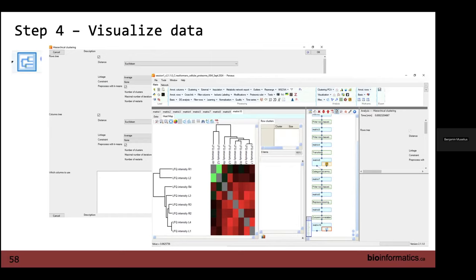So I would say it's a good default. If you know something about your data or know something about the type of information you're trying to get out of your data, you certainly can use one of the others, but Euclidean is a fairly safe bet in the standard.